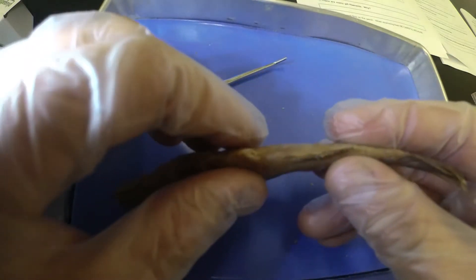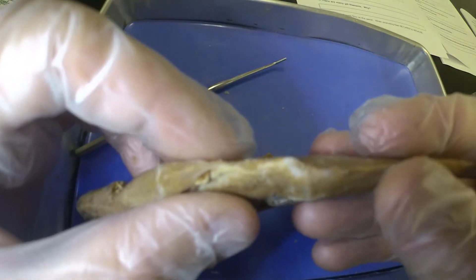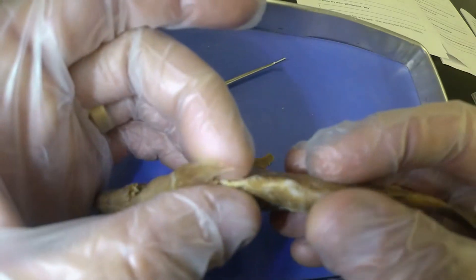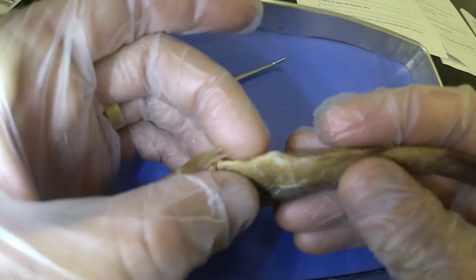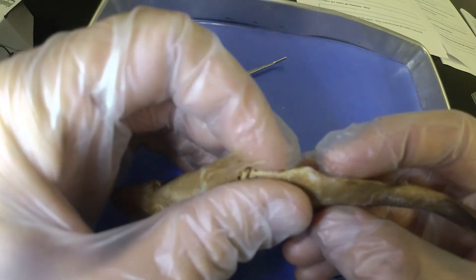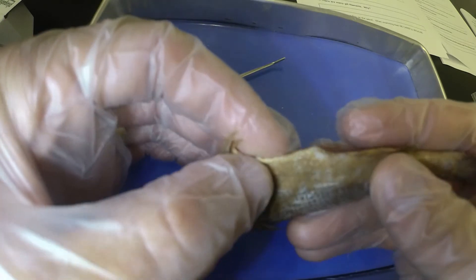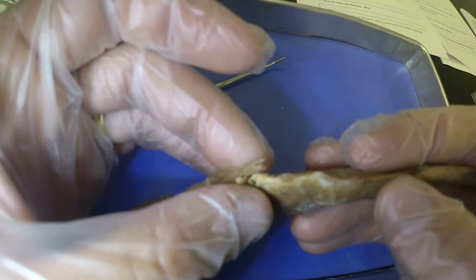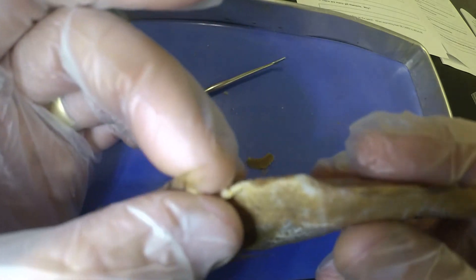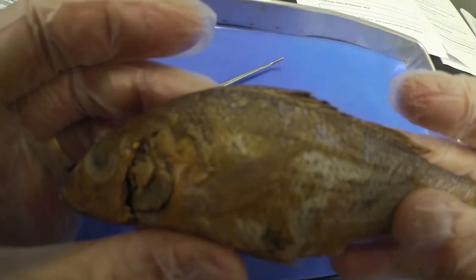Next, it wants us to look at the sex of our fish. We're looking to see how many holes it's got here on the bottom — essentially looking for an anus and a urogenital pore. If it's a female, it's also going to have a genital pore. In this case, it looks like we just have two openings — an anus and a urogenital pore — so that would indicate a male.